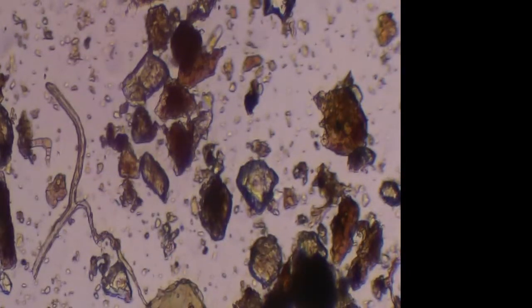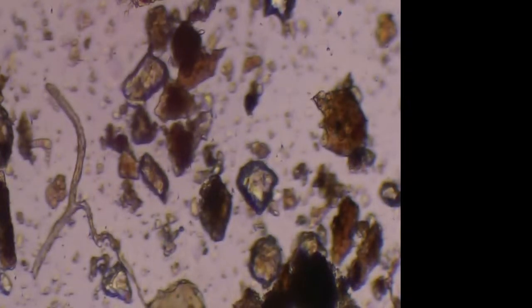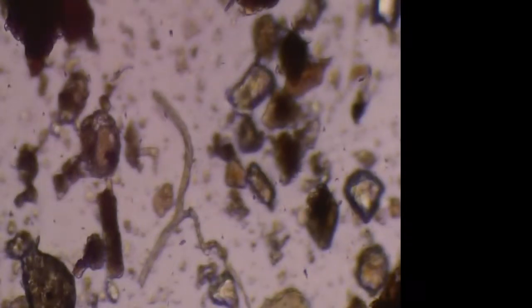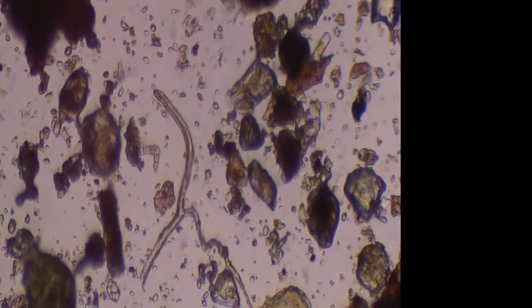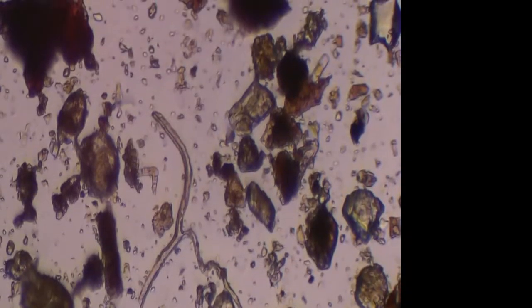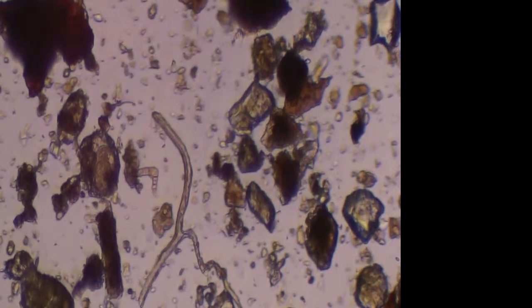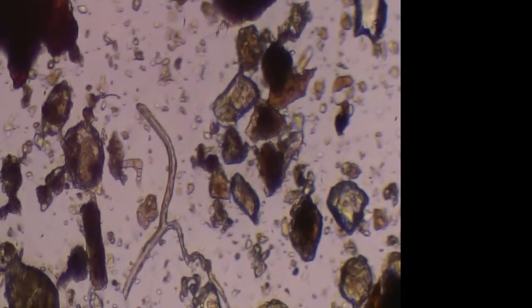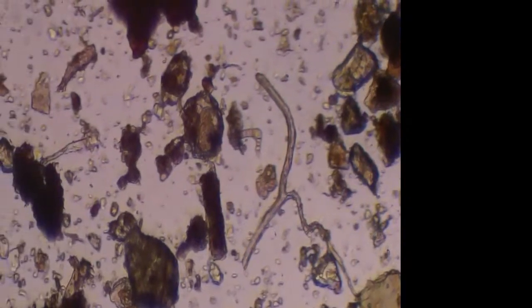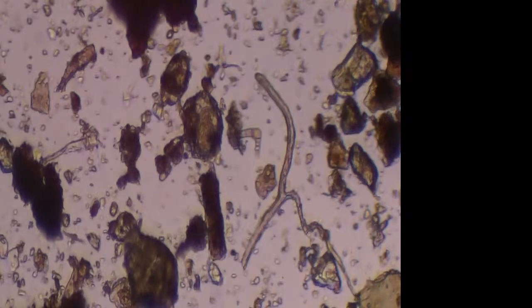Some good shots of fungal hyphae. I'll take a little piece of it there. A little wiggly zigzaggy thing, that's a piece of the fungal hyphae that forms the whole network structure of the fungus underground. To the naked eye, it's just this white fuzzy stuff. Just like when you get fur on your red mold and stuff like that, that furry stuff is just fungal hyphae growing in mass numbers. So to the naked eye, it looks like fuzz, but it's actually little tubules like this.